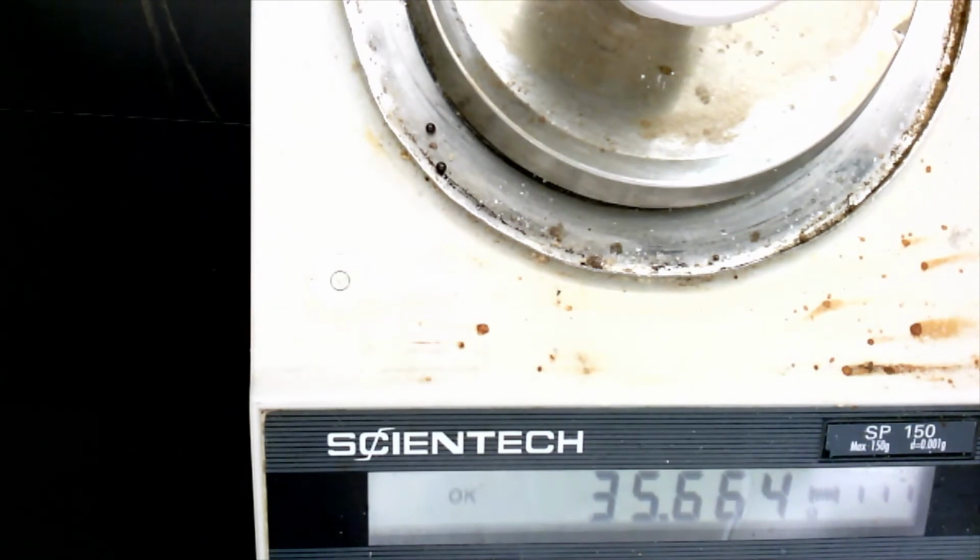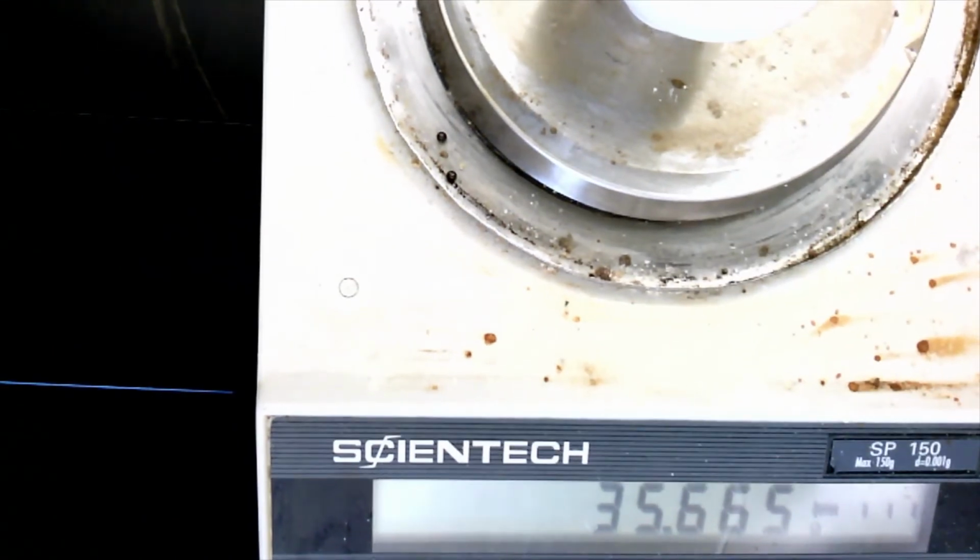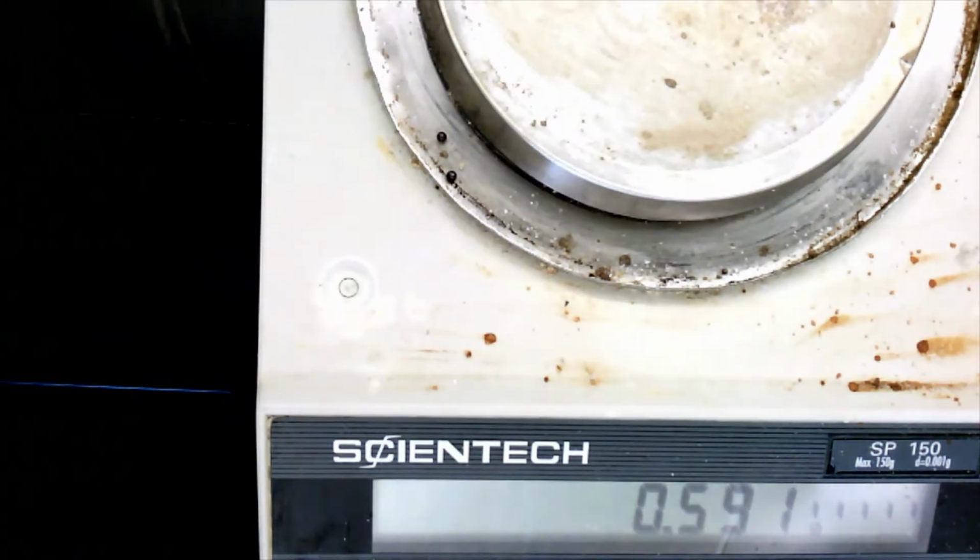So, 35 point, fluctuating a little bit, 661. Okay, 35.66. Well, now it's saying 2. 35.662. We're going to stick with 662 grams. That is the mass of our crucible, lid, and magnesium oxide. So make sure you put that in your report sheet. Okay, and then you can find the mass of your product.